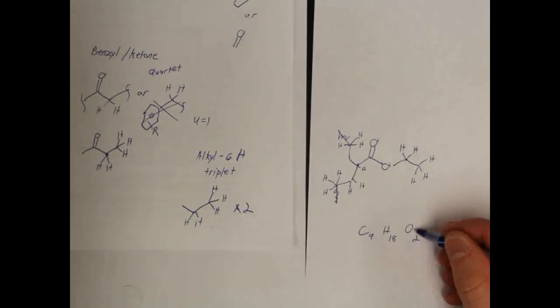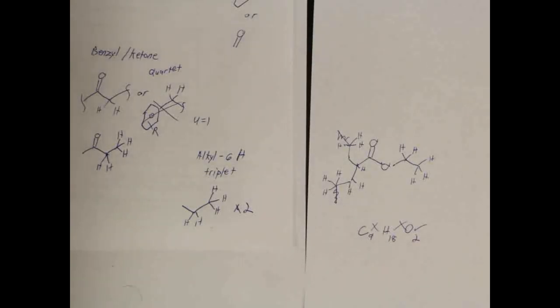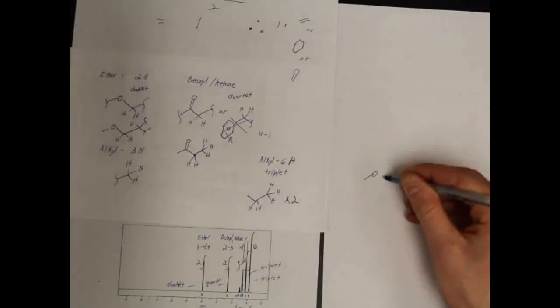Here, you want to try and tear down the structure you just built. Does the molecular formula match what was given? Are the protons and carbon shifts where you'd expect them to be? Most importantly, does the coupling of the protons match the number of neighbors in your structure? If not, build a new structure and repeat the testing.